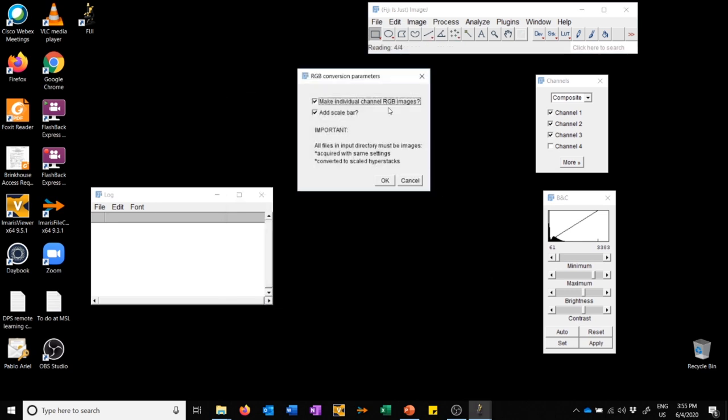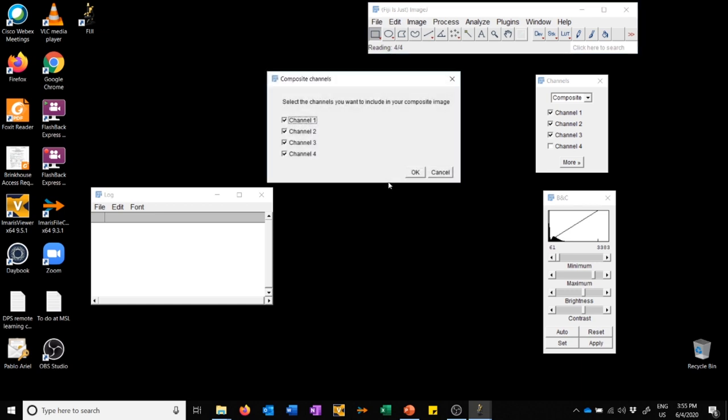Here it asks me a bunch of questions. Do you want to make individual RGB images? This means, do we want an image of the composite and an image of the red, green, blue, and gray channels? Usually it's a good idea to leave that on. Do we want to add a scale bar? This is up to you. I'm going to leave them both on so you can see what happens. Here it asks which channels you want to include in your composite image. Let's say we don't really care about the far red, so I'm going to exclude it. We're only going to use the first three channels, the red, green, and blue for the composite image. I'm going to say OK.